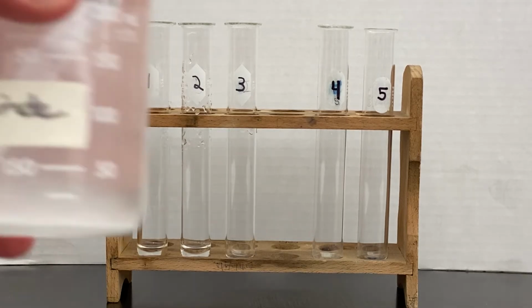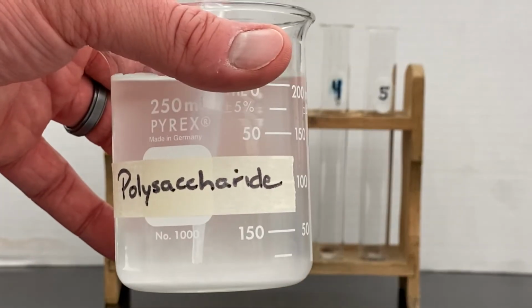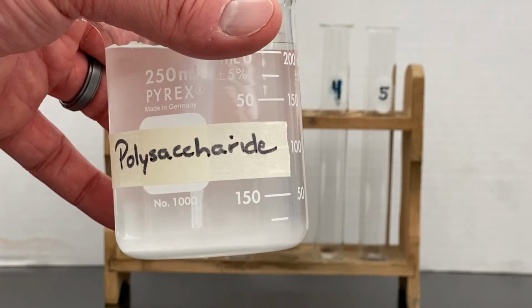And finally, I'm going to take 30 drops of a polysaccharide solution and put it into test tube number 3.